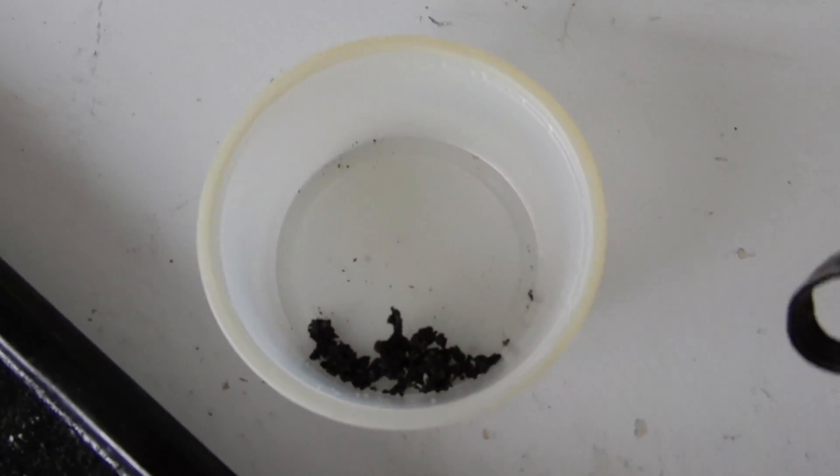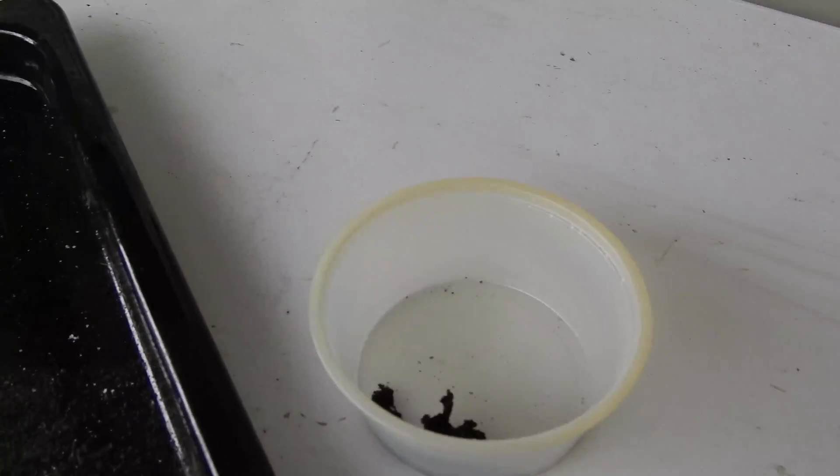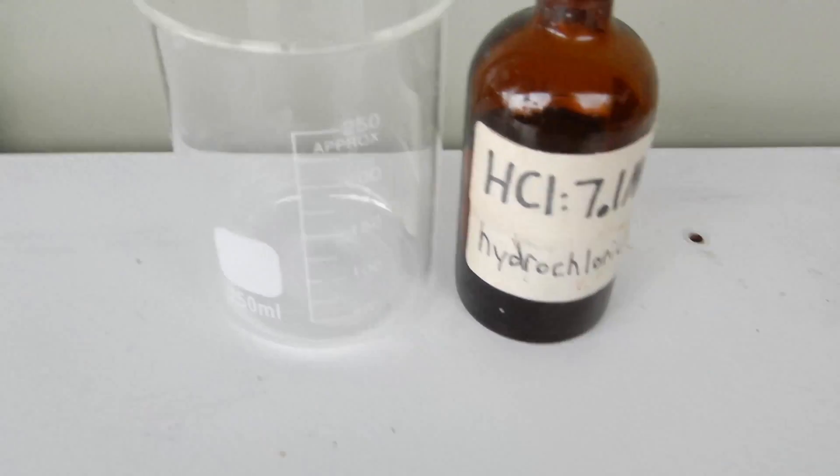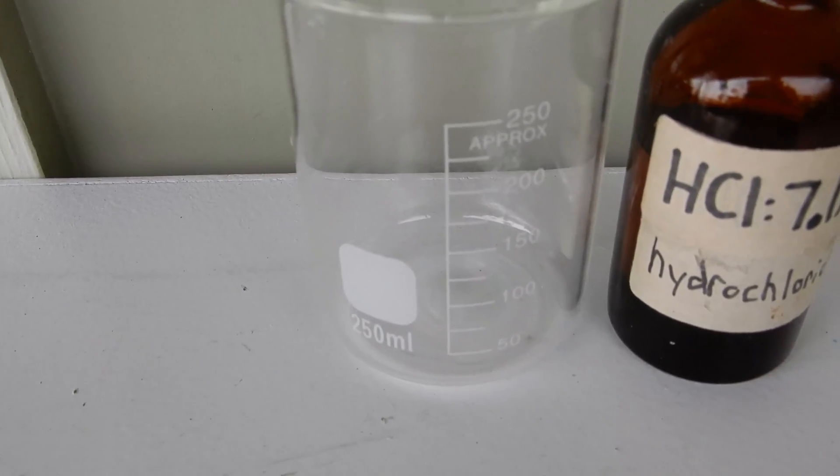I began to pick out some globs that I knew had nickel in them, but then I realized I should probably just take the lazier way and dissolve — chuck all the slag, including some tiny droplets of nickel, into a dilute solution of hydrochloric acid. So that's what I'm going to do right now.